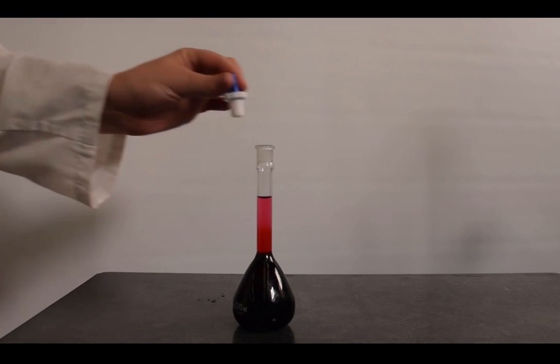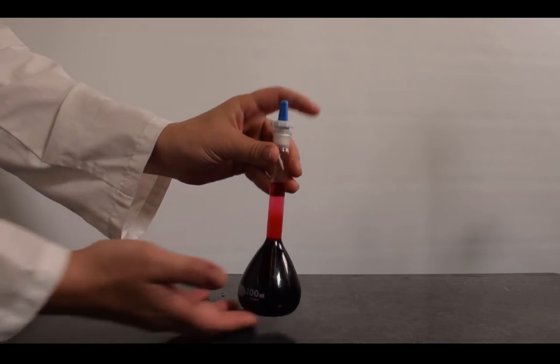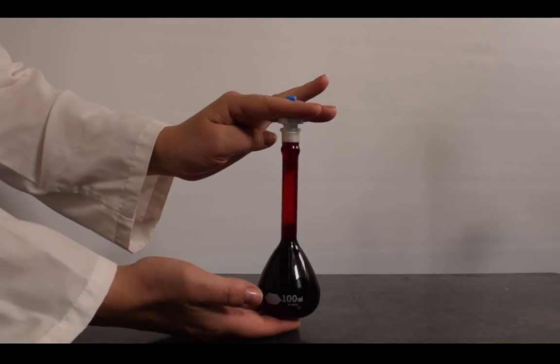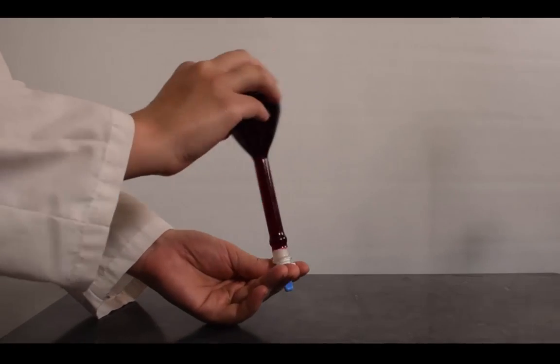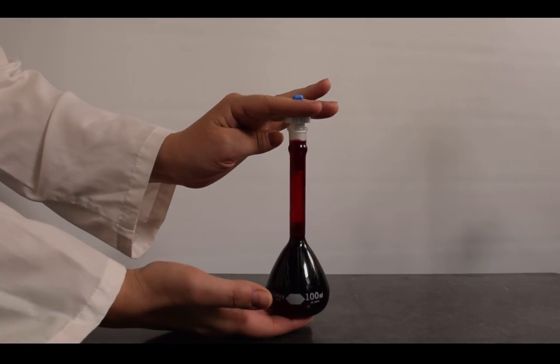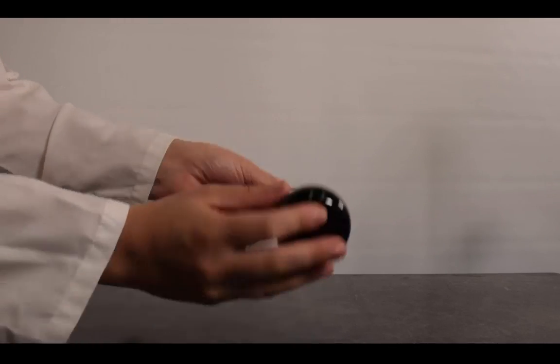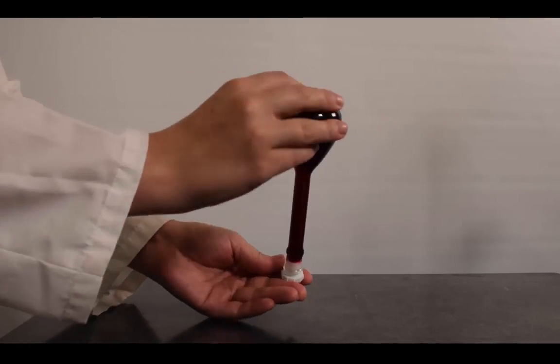Once diluted, stopper the flask. Invert the flask while holding the stopper and shake. Return the flask to its upright position and allow the air bubble to reach the top of the flask. Repeat these mixing steps for a total of ten times.